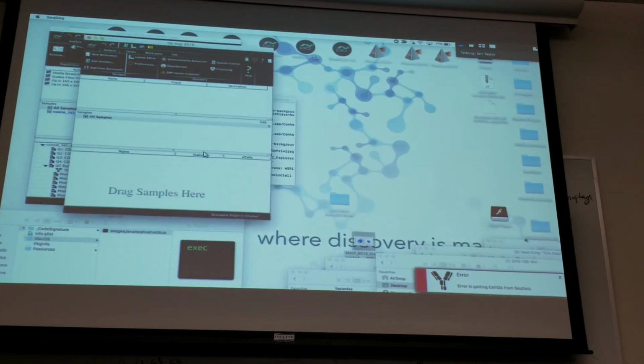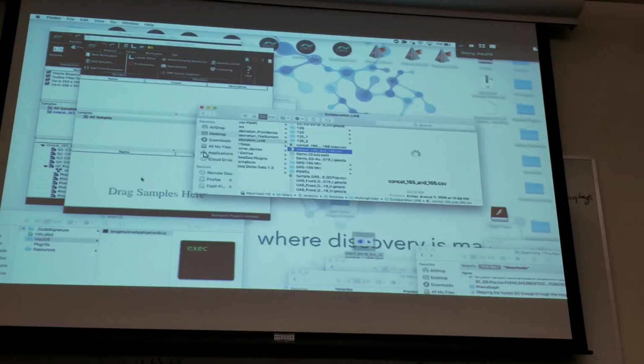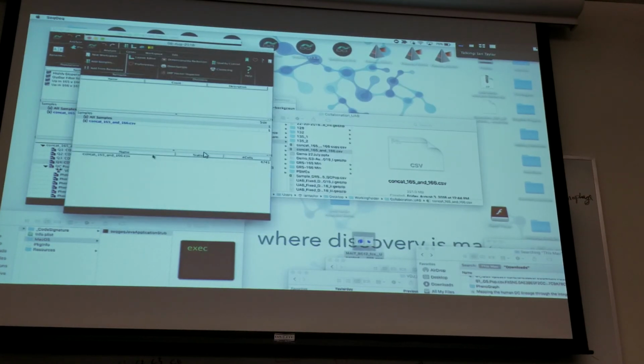Okay. Yeah. Well, it worries me for sure. I'm going to try just loading in the raw data and make sure I can connect before I create all these populations and do this analysis. Ideally, it would work right here. Let's just double check that everything seems right to begin with.